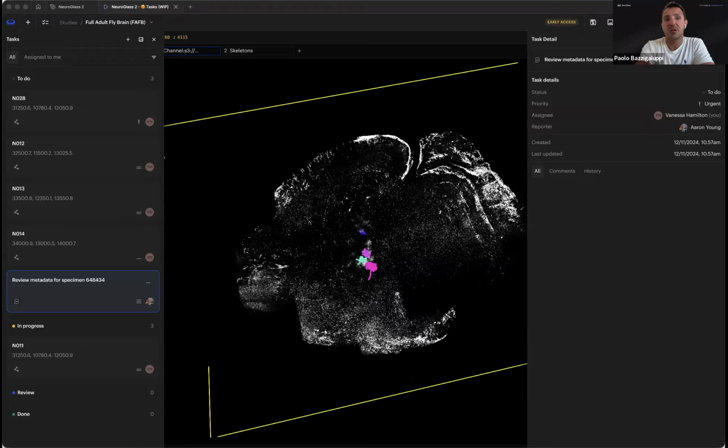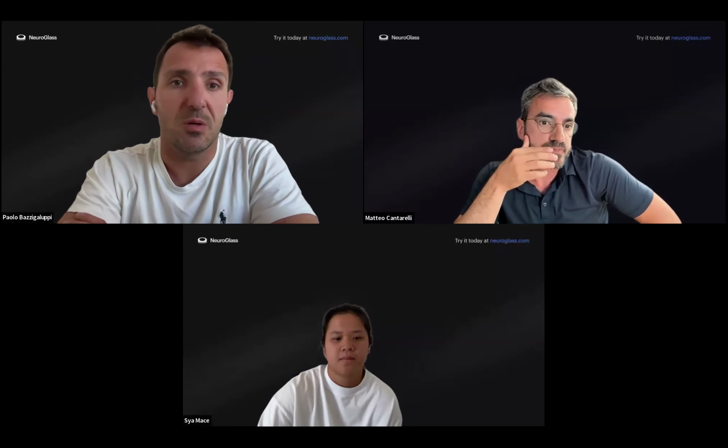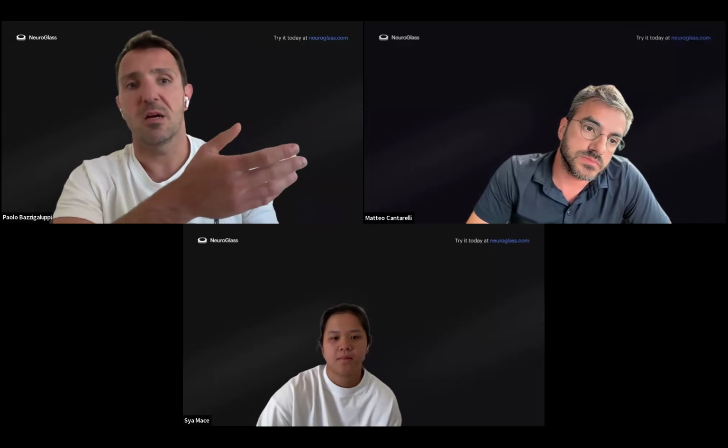The first of these features is essentially what Saya has shown us: a task management system where scientists and researchers will be able to assign collaborators or even AI agents to perform work, in a frame where AI and humans work together.